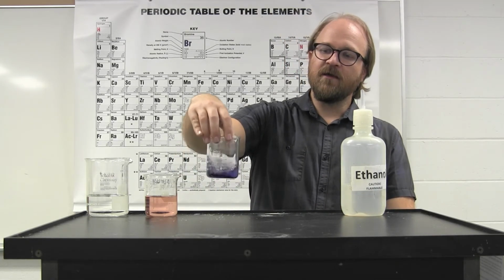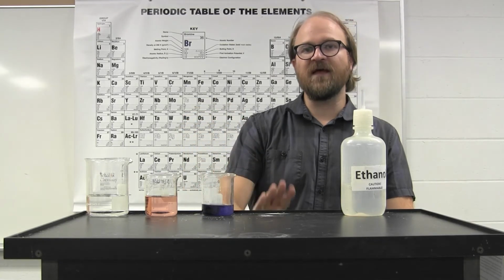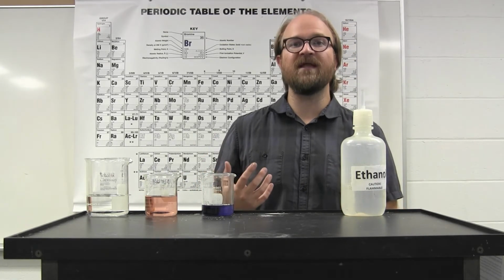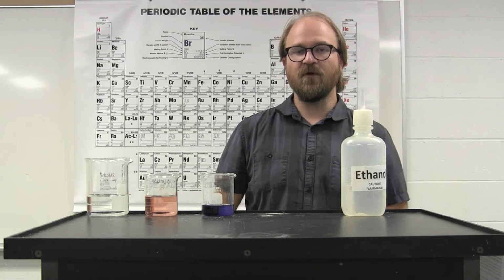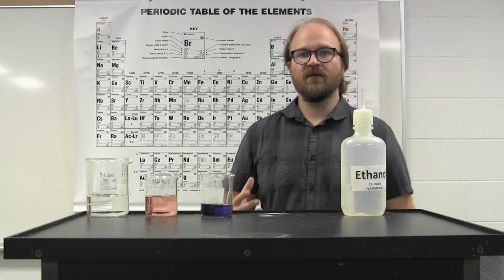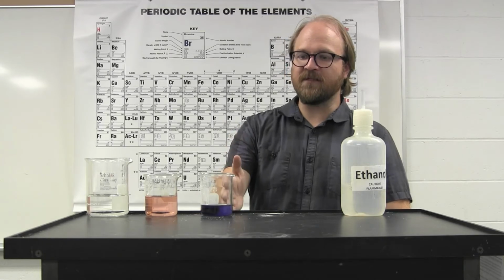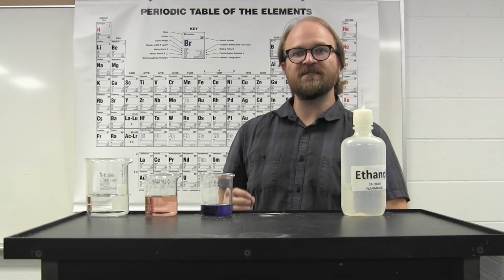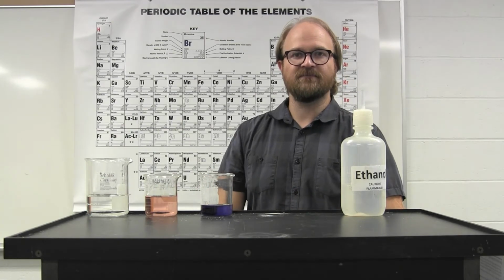However, using the blend of cobalt tetrachloride and cobalt hexaaquo, there are 2 peaks. There are 2 competing molecules and complexes in equilibrium with each other. When these are combined, you get the color scheme of both of them. Using a spectrophotometer, you could obtain the absorbance of each of these different wavelengths and correlate that to a specific concentration of both of the complexes.